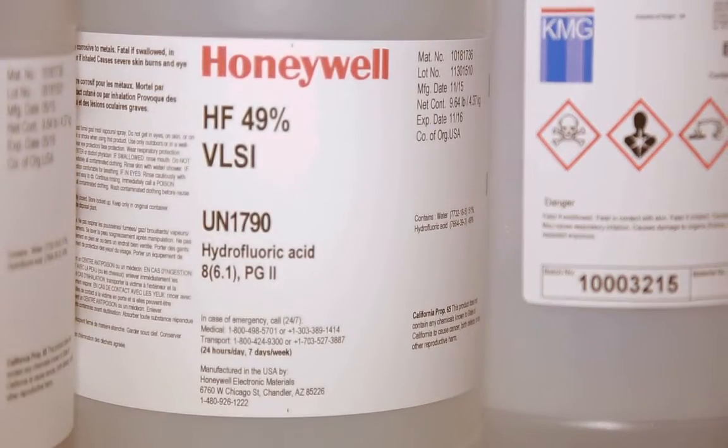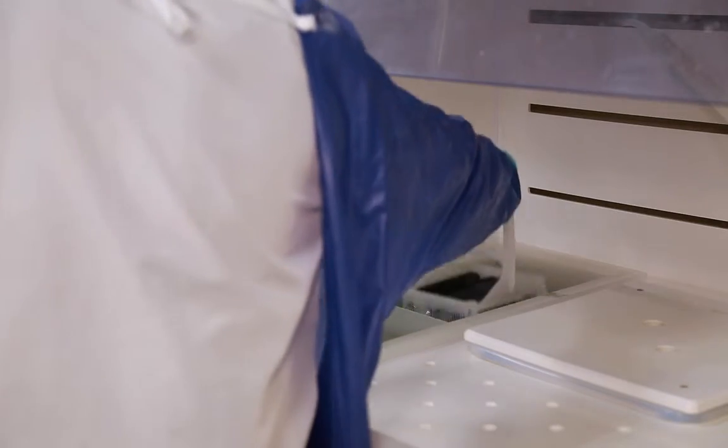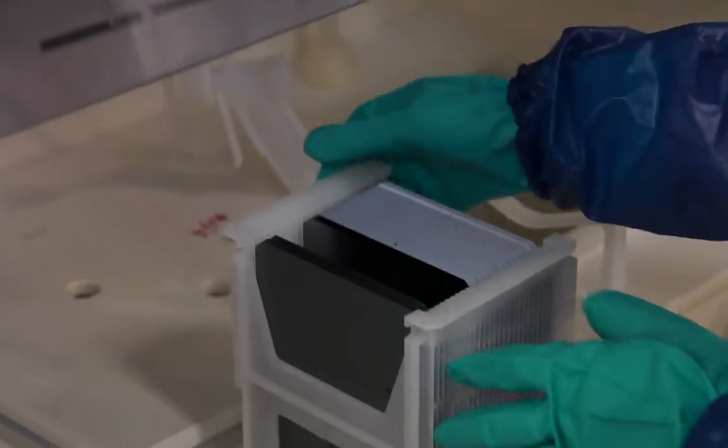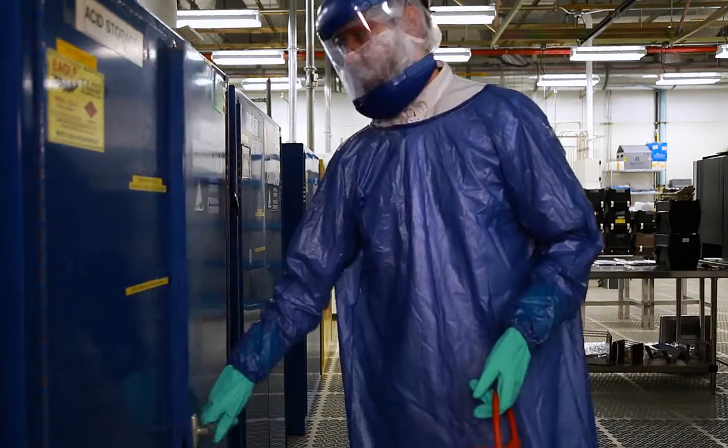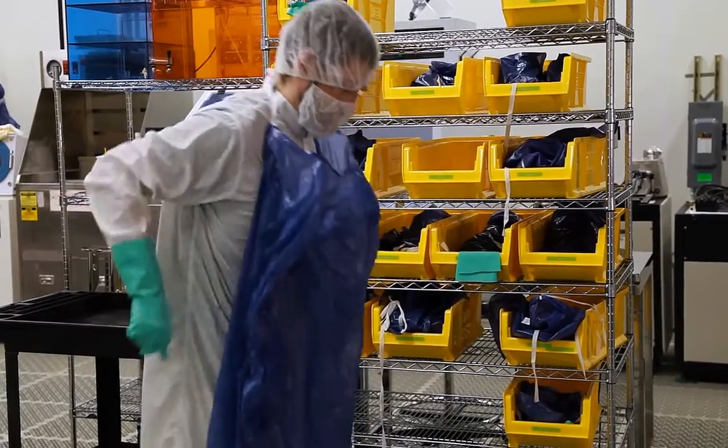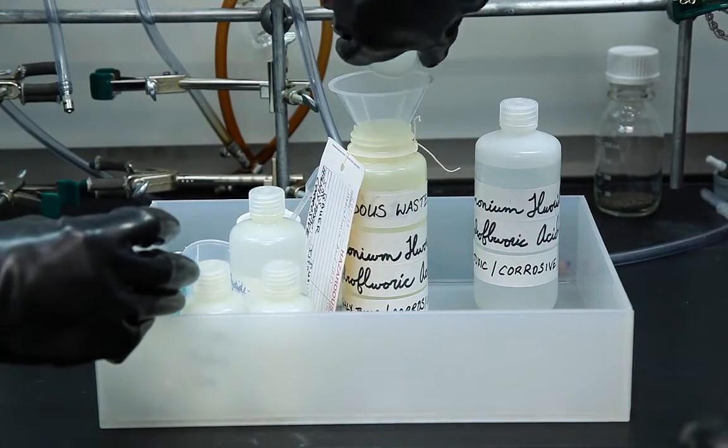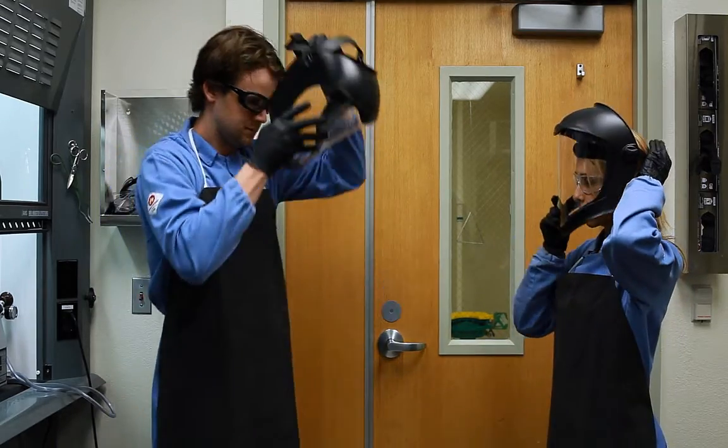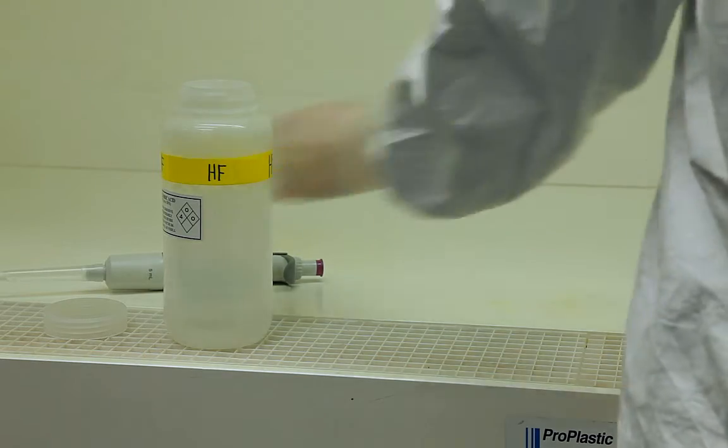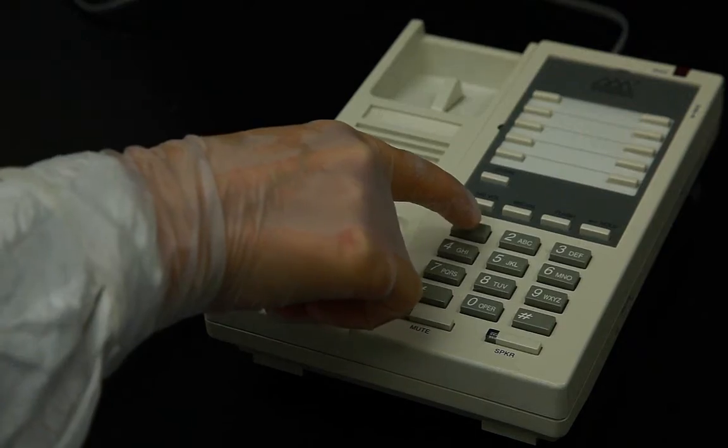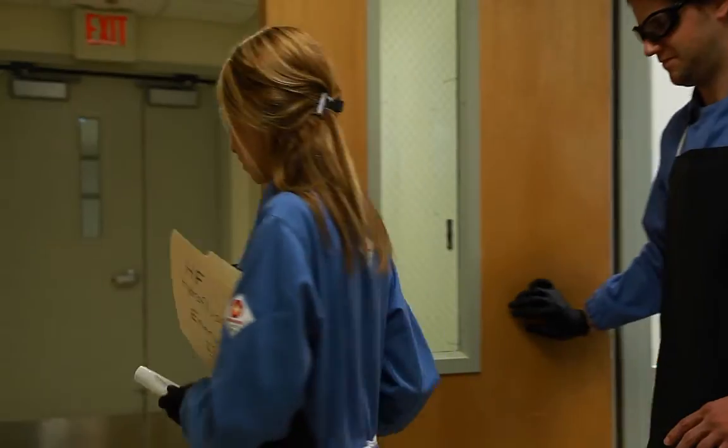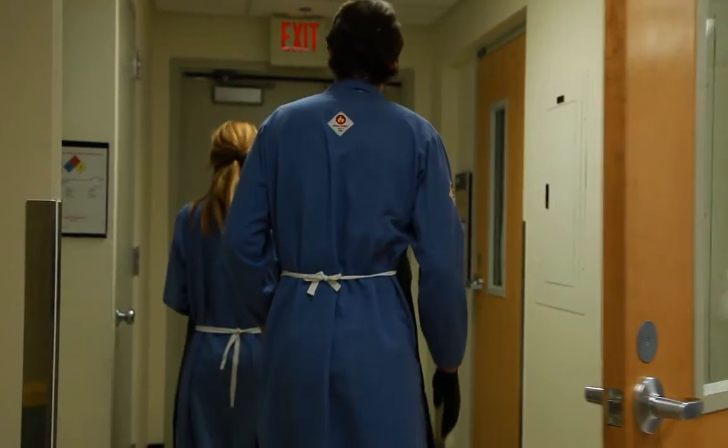HF is a necessary and vital asset for several research purposes, from etch and cleaning semiconductors to removing silicates from asteroids, and must always be treated with respect. However, even with all the protective measures adhered to standard operating procedures and proper PPE, accidents can still happen. So you need to know the emergency procedures instinctively, thereby acting quickly and properly to mitigate any serious health effects. Thank you.